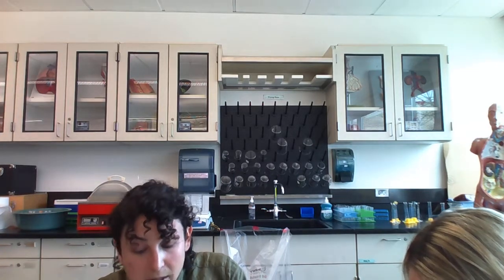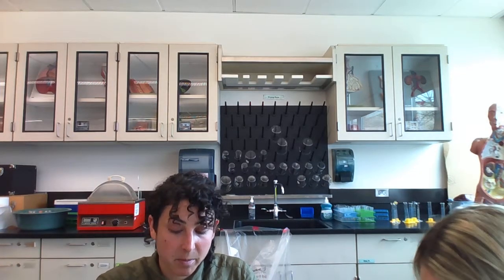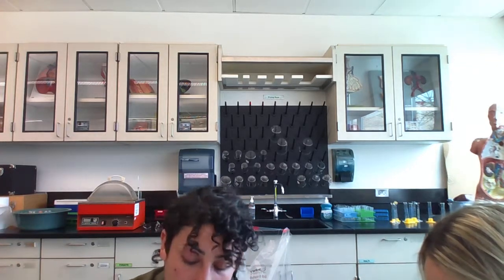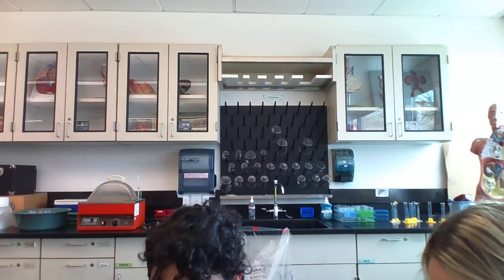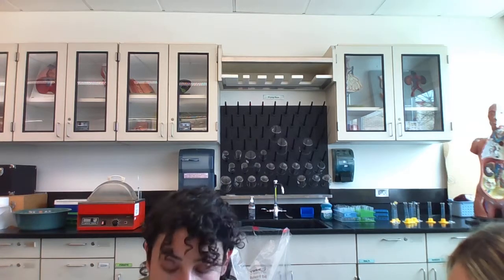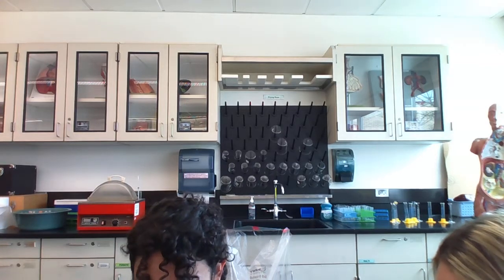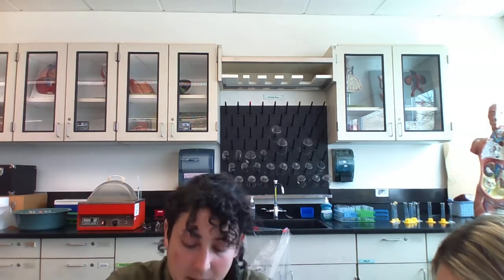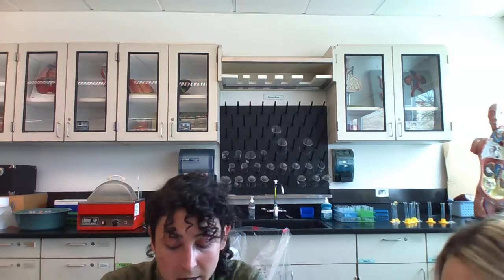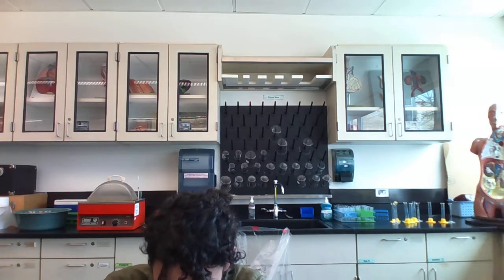Same thing with this. So this is like the extreme opposite. Basically, this is body temperature. This is if you were freezing or something. So it's seeing how digestion is slowed in a cold environment. And this will probably be the most expedited process in our body, because bile will help the breakdown of fats. And then this will just slow it. So this is the best example of what may happen physiologically. These are the controls. Okay, cool. That makes way more sense.